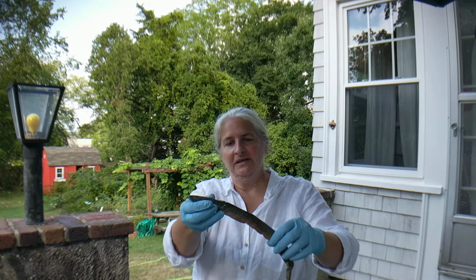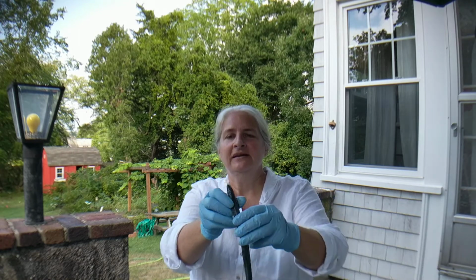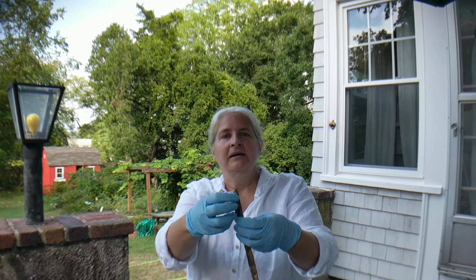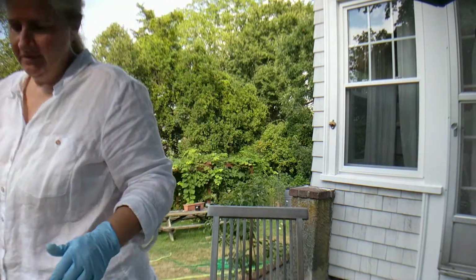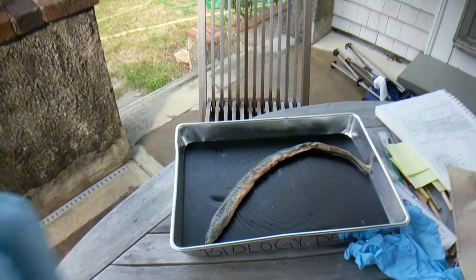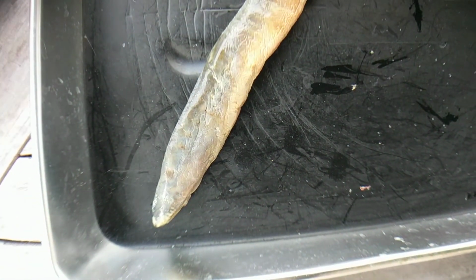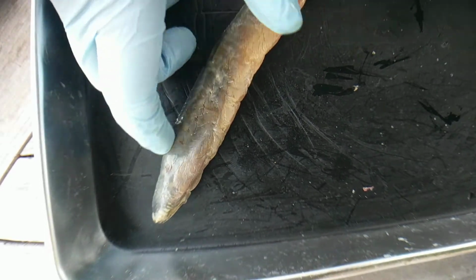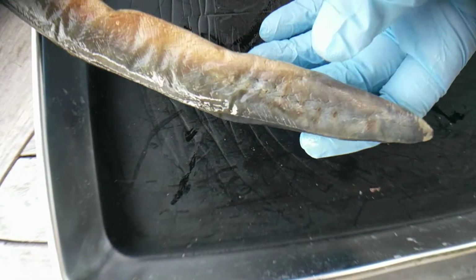So you can see this is about the size, right? They have a little sucker mouth for their blood-sucking habits. And I'm going to rotate down now so you can see. All right, I'm just going to go through first some of the external features under the camera here.